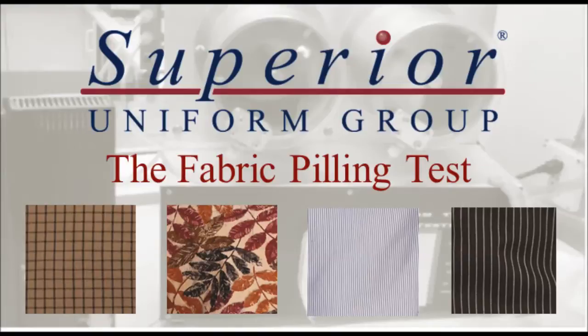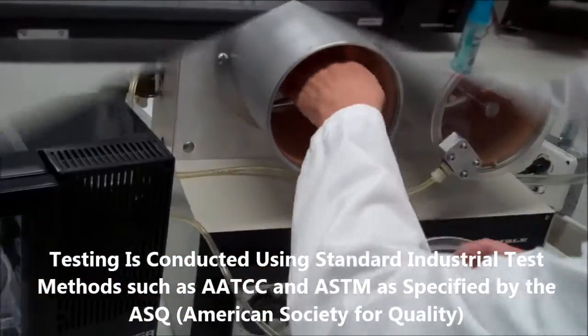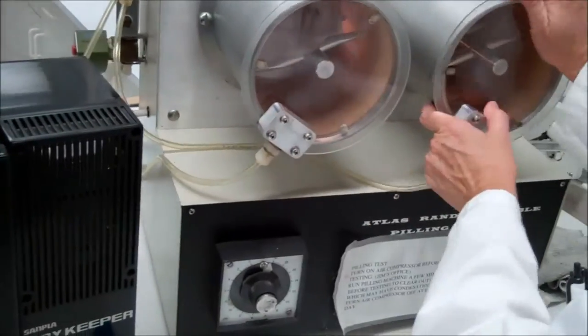Thank you for joining Superior Uniform Group as we proudly demonstrate the test we performed to measure fabric pilling. Three squares are put into the left drum, three into the right.